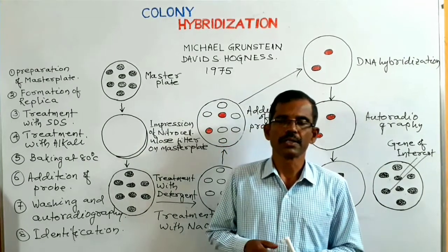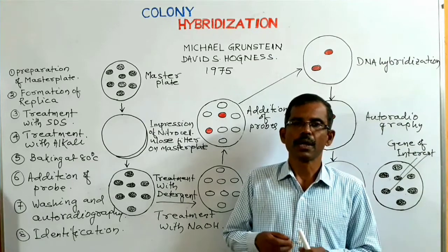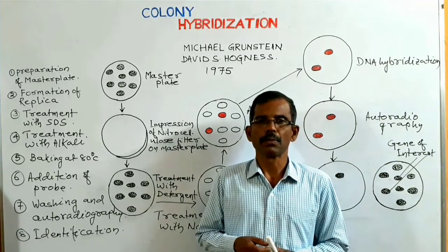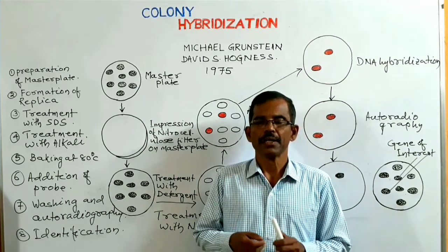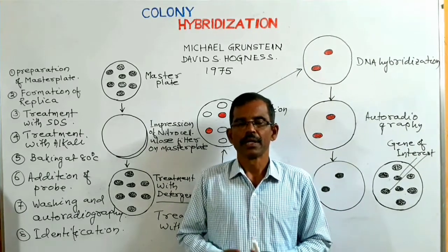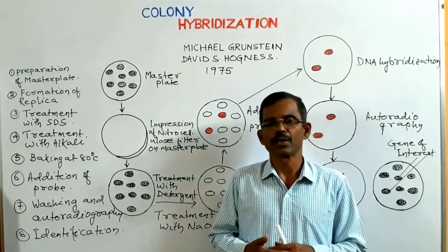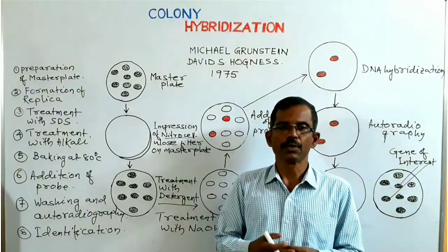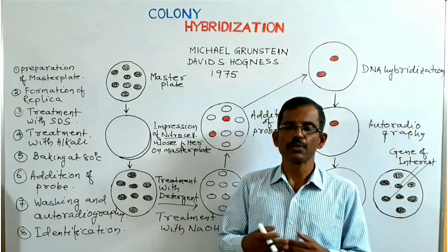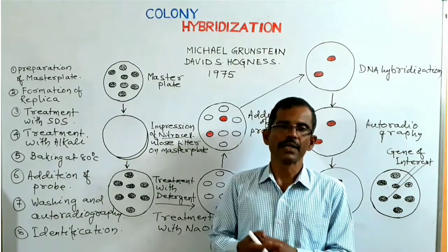Friends, today we shall discuss colony hybridization. Colony hybridization is a simple but powerful technique useful for screening gene libraries. In recombinant DNA technology, after construction of the recombinant DNA, the recombinant DNA is introduced into a suitable host, for example, E. coli and yeast.